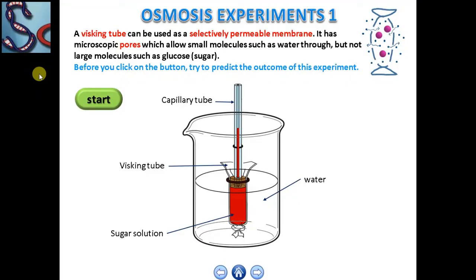This is osmosis experiment number 1. A visking tube can be used as a selectively permeable membrane. It has microscopic pores which allow small molecules such as water through, but not large molecules such as glucose.